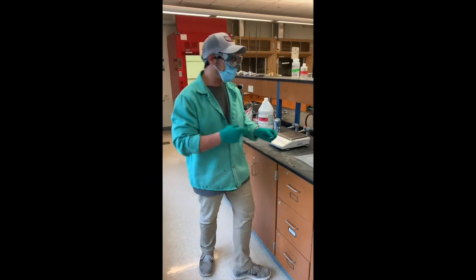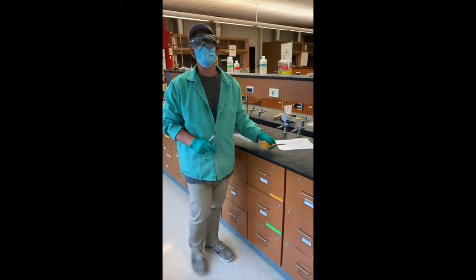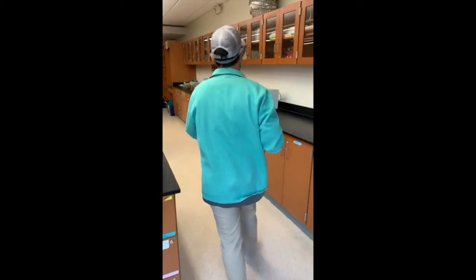So we're on step 2 now. We're going to be cutting our aluminum into strips. If we create more surface area, we'll allow the reaction to go a bit quicker.